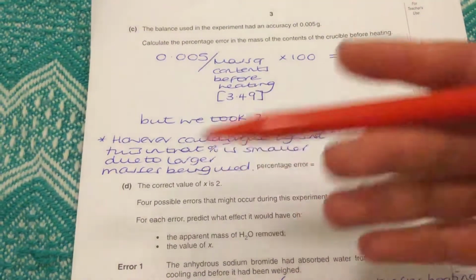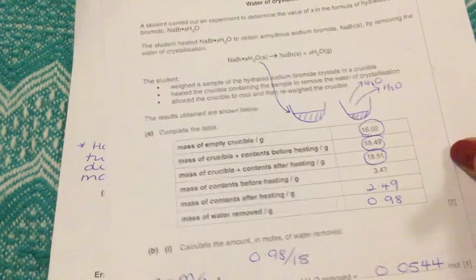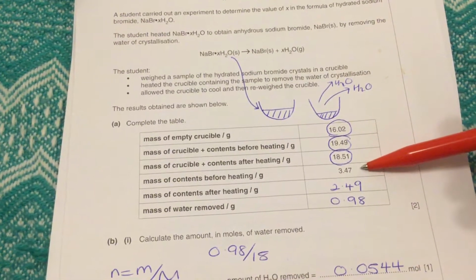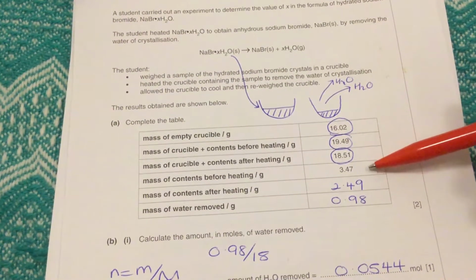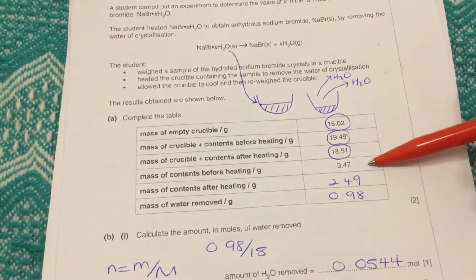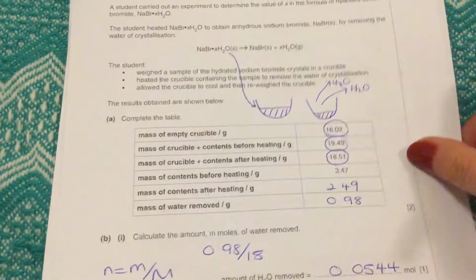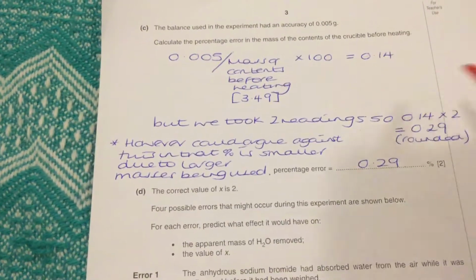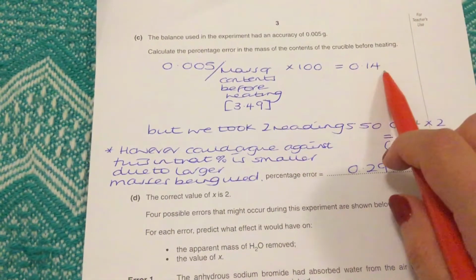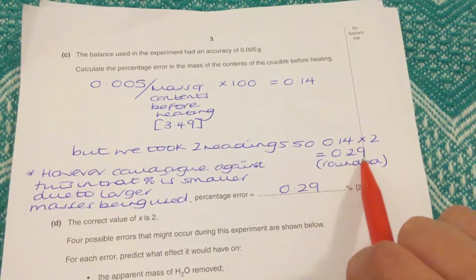The thing here we have to recognise is that to make a mass measurement, so to get this mass measurement here, we are going to have taken two readings. So this value here is processed data, and to get this we took a reading for the crucible and a reading for the mass. Therefore we've taken two mass readings, and so we would multiply our 0.14 plus its other numbers by 2, which gives us 0.29.